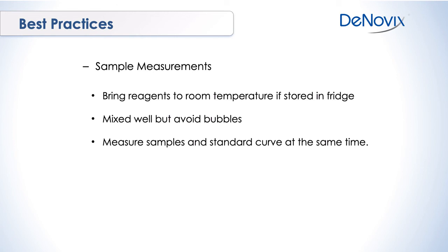The standard curve for our assay is only a 2-point standard curve, so it's a 0 or a blank, and a top standard. So actually creating the standard curve only takes a few seconds. So we always recommend that you use a fresh standard curve, but we do understand that some people like to save those curves and are happy to accept that there may be some systematic error when you save a standard curve and then create the samples at a later date.